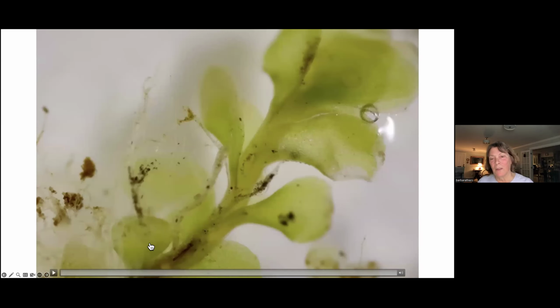Here's what I mean. In Scapania, it's very important to see whether or not the attachment of the ventral lobe is decurrent. It's very hard to pull off the leaf in such a way, or at least it's hard for me, that I would get that decurrency. But by looking through the dissecting scope and going up as high as I can in magnification, I can see, here, you have to maybe take this on faith, but there's a little line that runs down, and that's the decurrent attachment of the leaf.